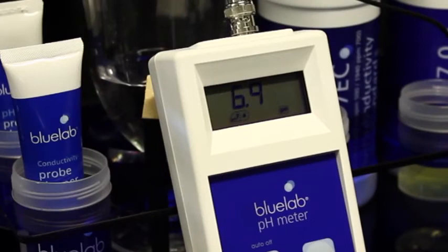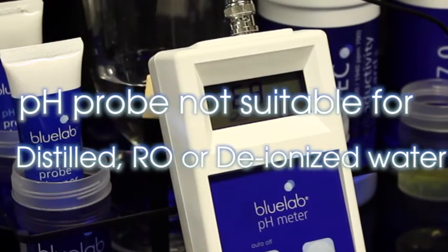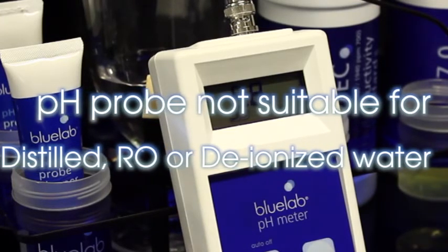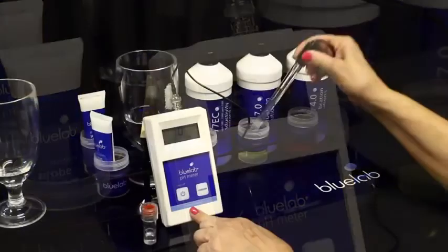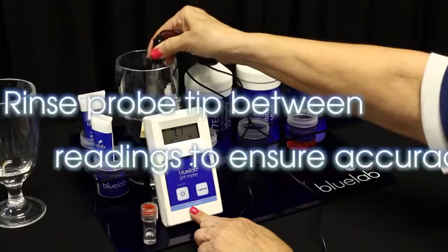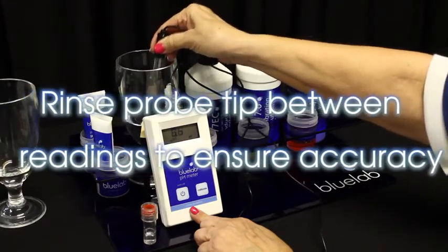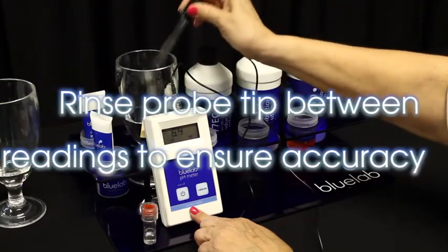To obtain a pH reading of your solution, wait until the reading on the screen stops moving — it may take a few minutes. The pH probe is not suitable for measuring distilled, RO, or deionized water without added nutrients, as the ionic strength is too low for an accurate pH measurement to occur. If you're taking measurements from different solutions, always rinse the pH probe using clean tap water to remove traces of the nutrient solution and ensure accurate readings.